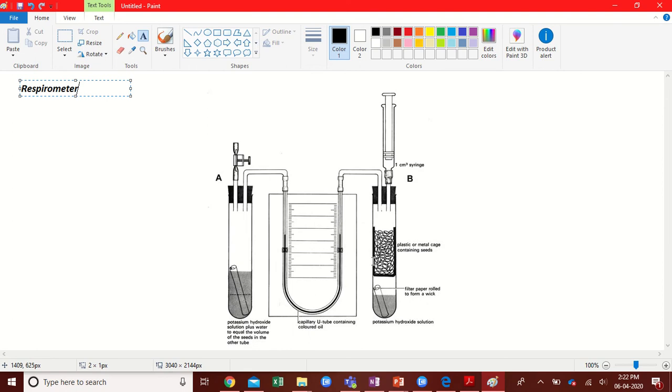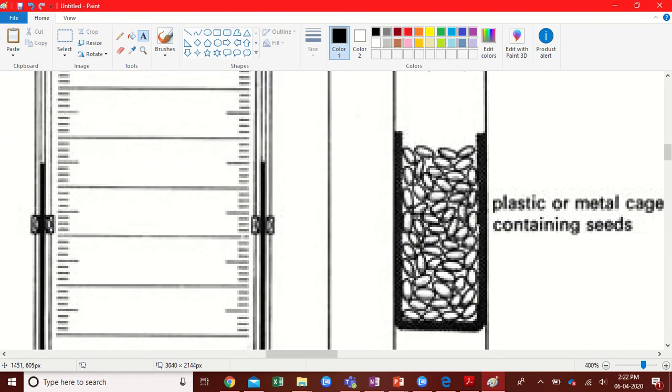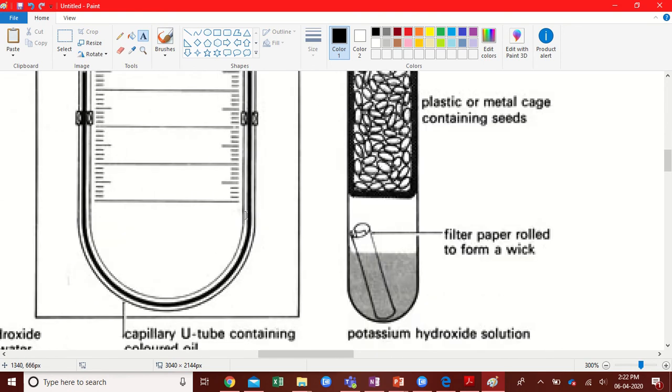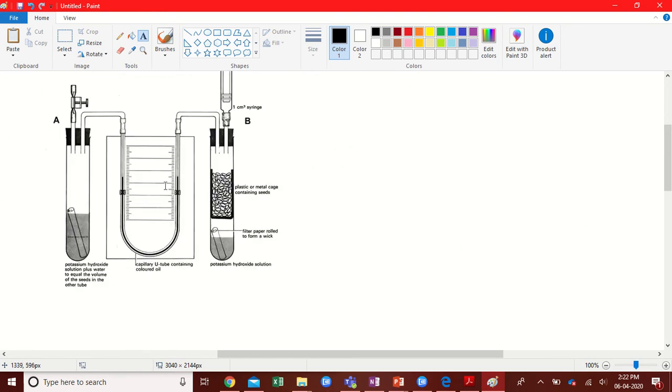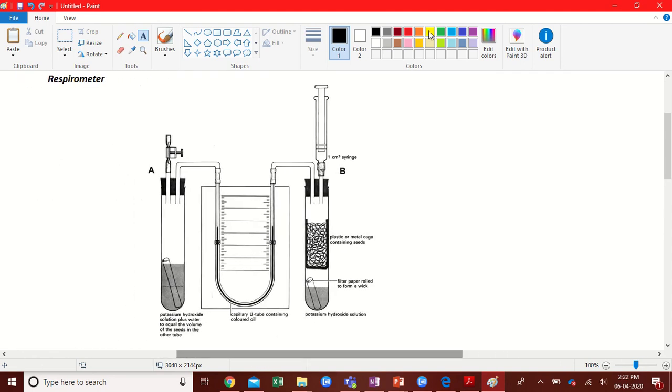What's happening here is, if you look closely, let's just move down. See here, it says plastic or metal cage containing seeds. So this is measuring the respiration rate of seeds. Now, what this is actually going to measure is the amount of oxygen that's going to be taken up into test tube B. So if I was to just show this, the movement of oxygen would start here, and this liquid here would actually be moving up this capillary tubing.